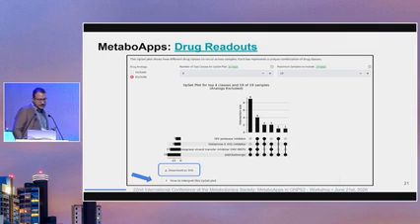And as you can see, for this upset plot, we have the co-occurrence of the HIV protease inhibitors, the histamine 1 inhibitors, the strand transfer inhibitors, and anticholinergic drugs.